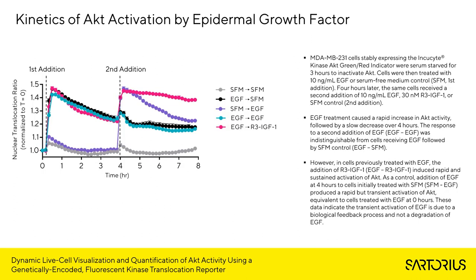Next, we'll look at the kinetics of AKT activation by epidermal growth factor. Unlike in many endpoint assays, in our IncuCyte live cell analysis assay, we can do multiple additions of drugs into the same treatment wells and monitor the activation of AKT after each addition. In this case, we're trying to see if repeated additions of EGF could cause additional activation. This would tell us if the EGF is being degraded in media over time, or if this is an actual biological feedback process causing this decrease in activation over time after EGF activation.